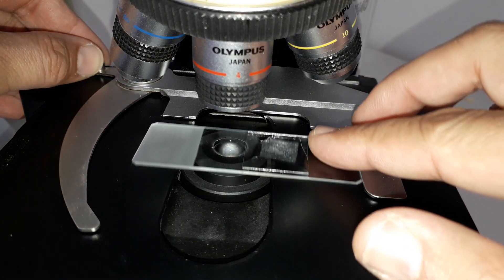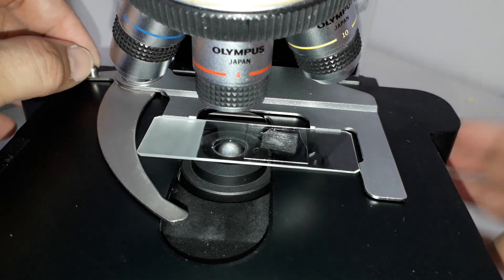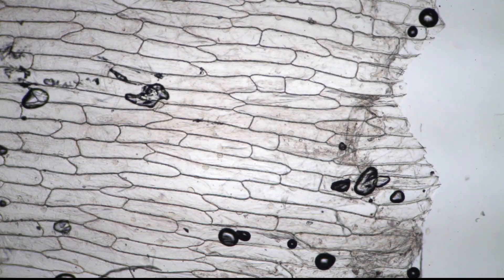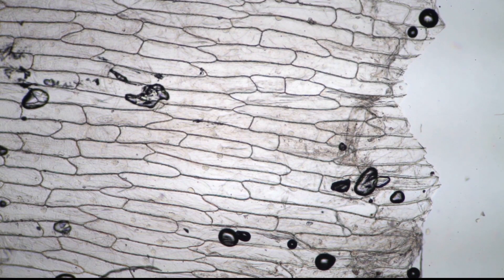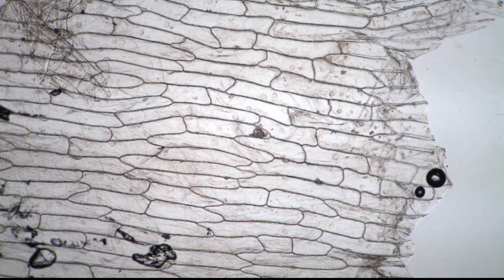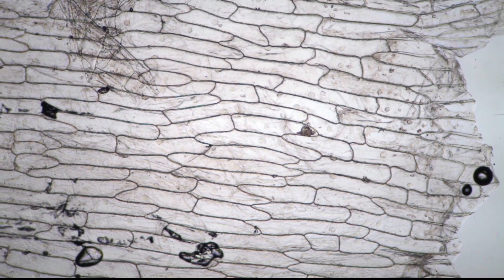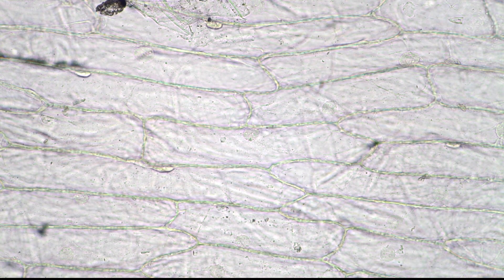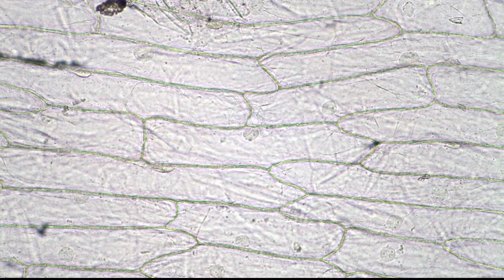The onion skin is now compressed and flat on the microscope slide and we're ready to go. It goes under the microscope and you can see that the cells look like bricks in a wall — all of those little horizontal structures are the individual cells. These are the cell walls, which are quite thick, but the inside of the cell you don't seem to see a lot of at this magnification. I'm using my four times magnifying objective.